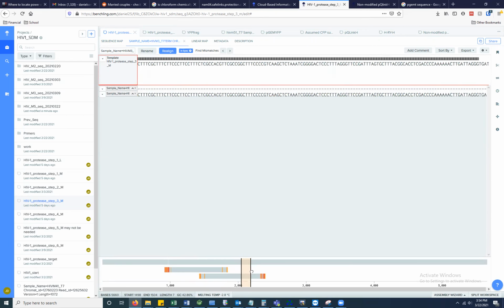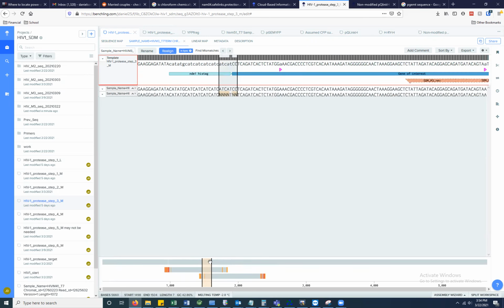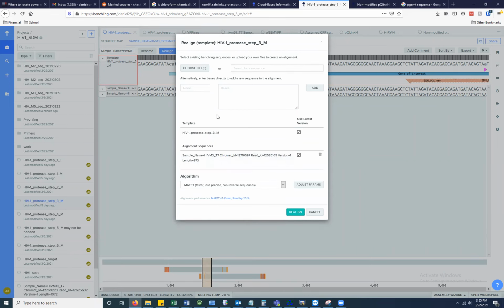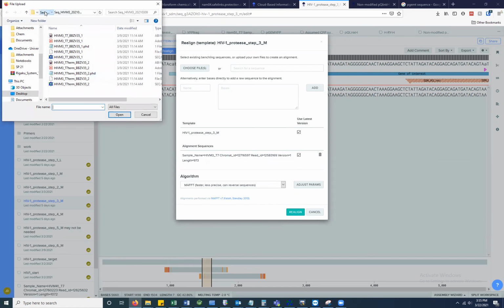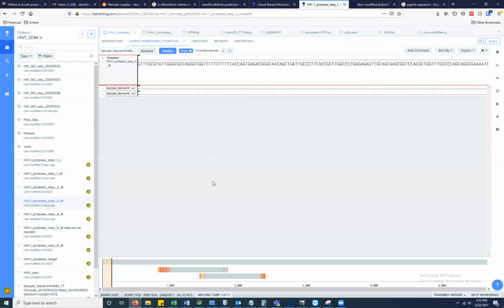Okay, so that's that. I guess I can go into how you do a sequence, and you can see if something's wrong. So if I, for some reason, let's say, I'll just do a different terminator in a different file. I go here and I use M4 and use this terminator. Realign. Should get errors, not errors, but it should be less.